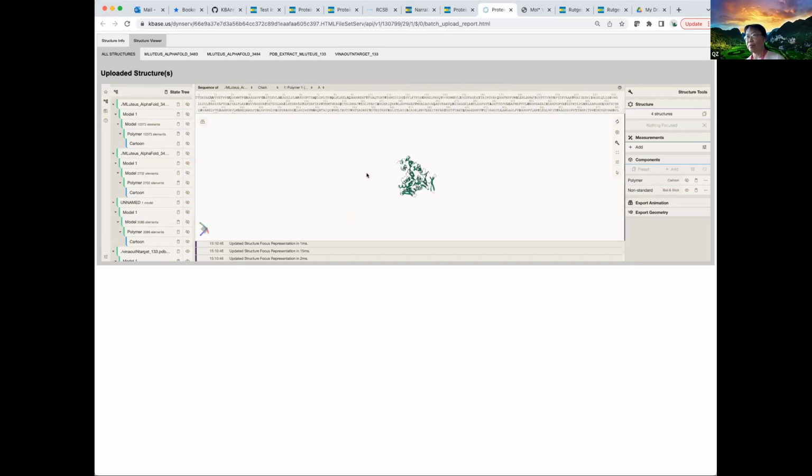Yeah. And then you can see 2 of them. Maybe this is the time, we just learned from Shuchi that you can do some superimposing of the structures. In this case, they are all very similar, so you can color them in the regions as well.